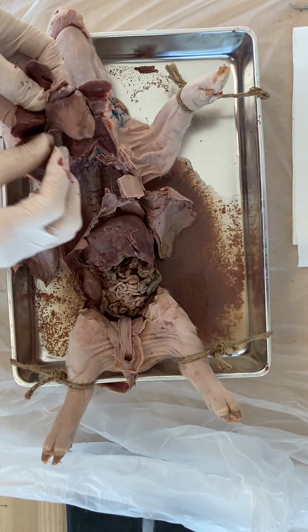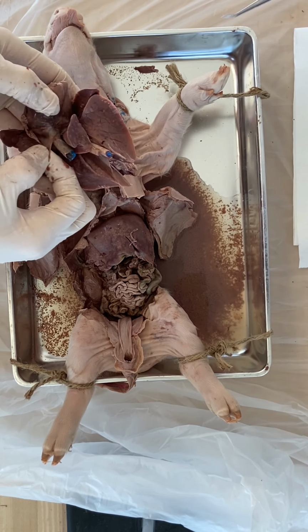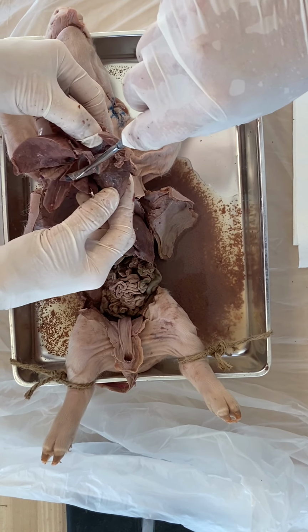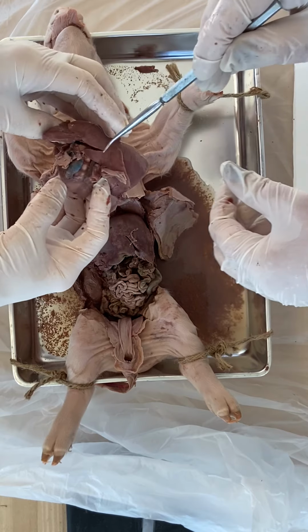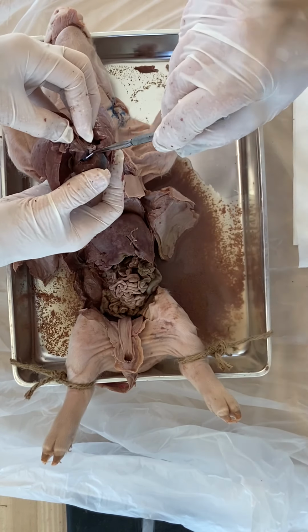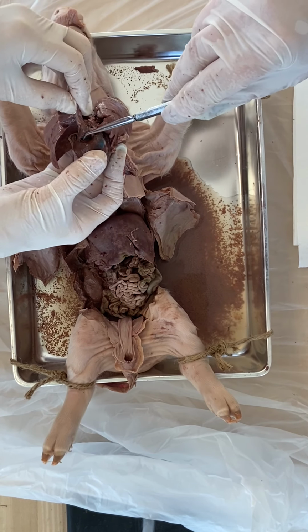Oh, so the heart is not... See, this must be the vena cava, the one that I thought might have been the aorta, but you can see it's coming into an atrium. Okay, so this is the inferior vena cava and the superior vena cava coming up. It's covered in tissue, and there's the hole for it to go in.